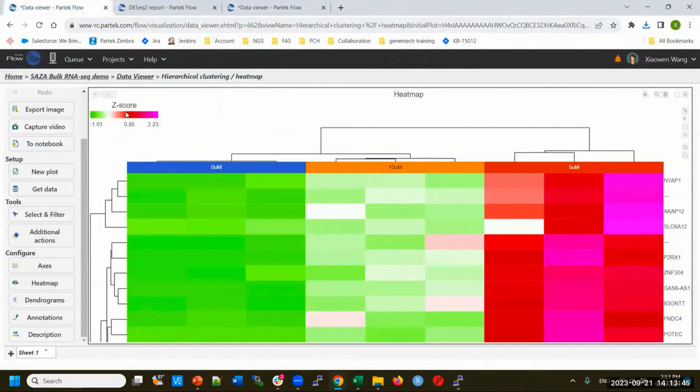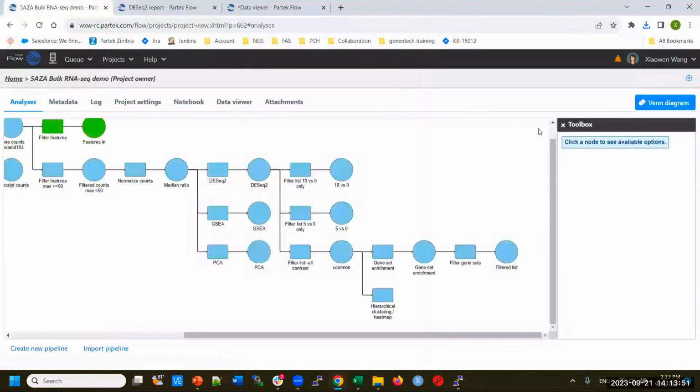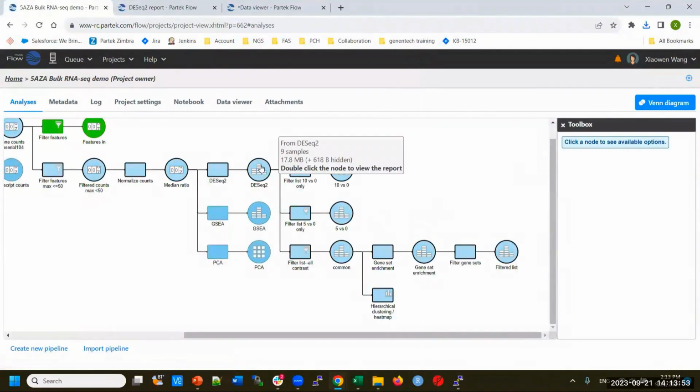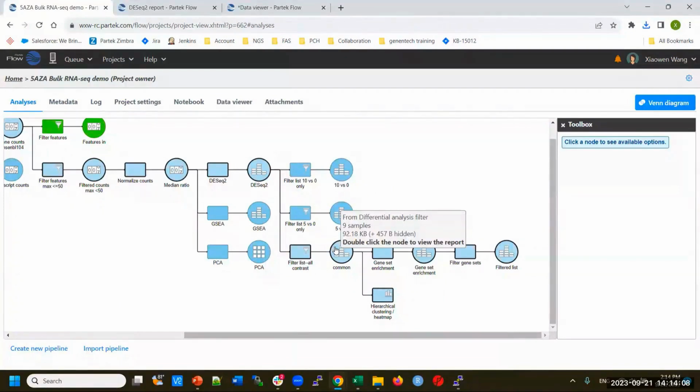Okay, so that is how you present your discovery using a heat map. I think a dot plot is good to look at each gene individually. That's the highest resolution to display the gene, but a heat map is good to look at multiple genes together. So now we got the genes, find the genes showing differential expression between different treatments.